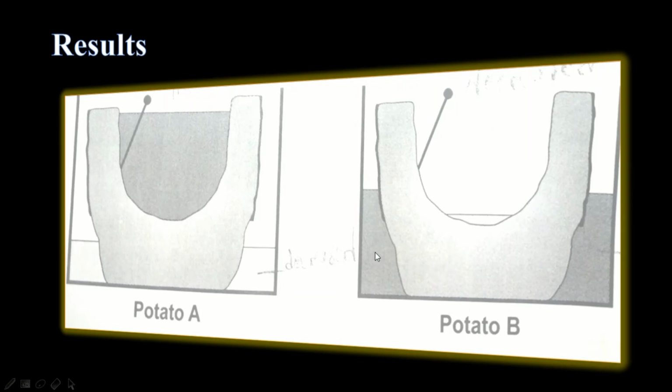So in the beaker we have less water as compared to the hole. What you have in the beaker is your salt solution, not pure water. So this is why your water moved from the potato, through the cells of your potato, which is our plant, and then to the beaker. Now what happened to the water in your potato?